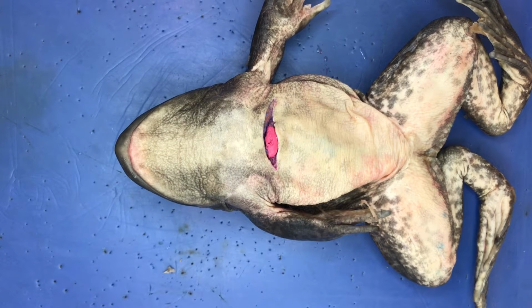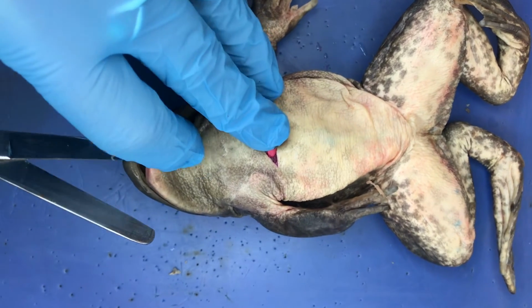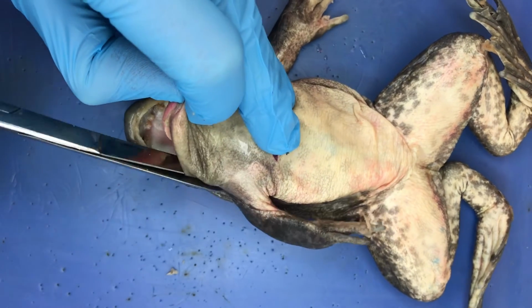We are now going to explore the anatomy within the oral cavity and pharynx of the frog. To do so, we first need to cut into the corners of the mouth so that the area within can be fully opened and examined.